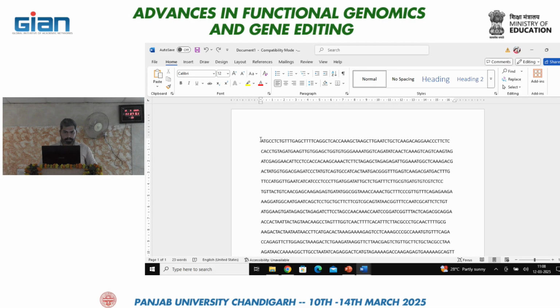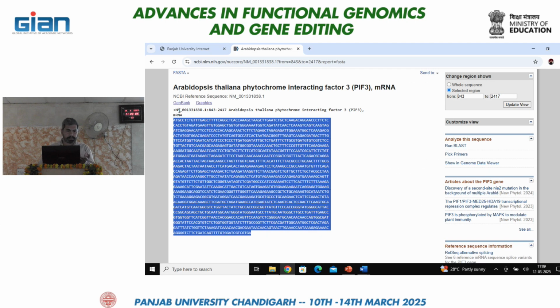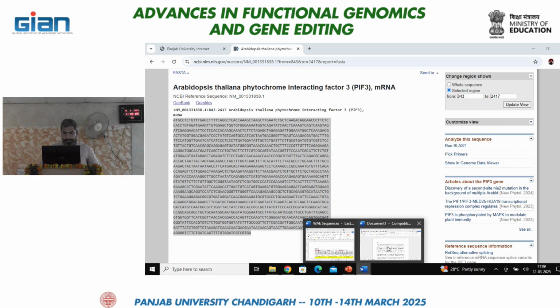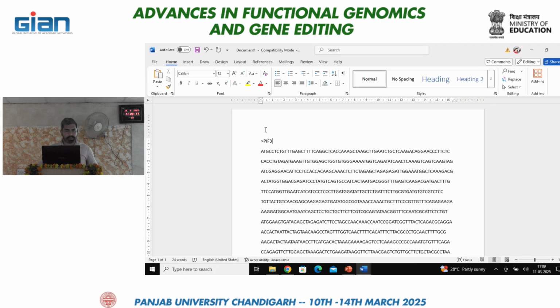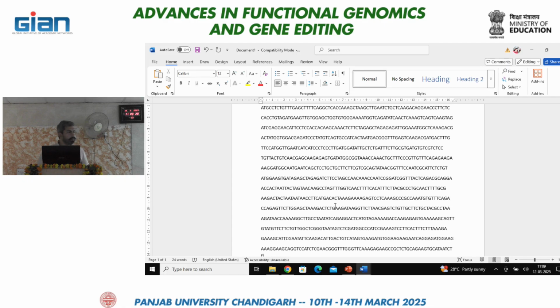So as the sequence has to be in FASTA format, we'll add the identifier first and write PIF3. We didn't copy the header as it is, as there was a very long header, so we have just simply written it PIF3. Once you have pasted, please let me know, then we can proceed.